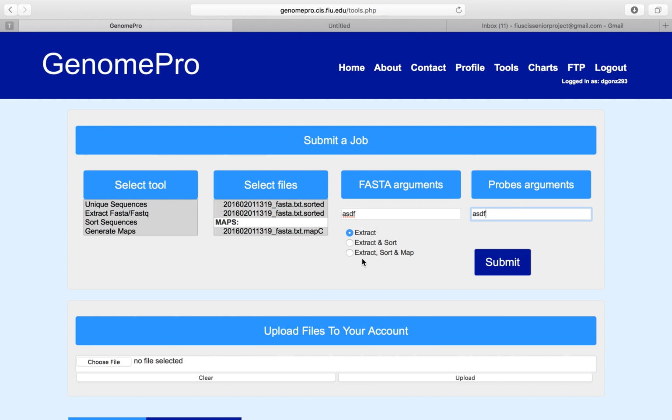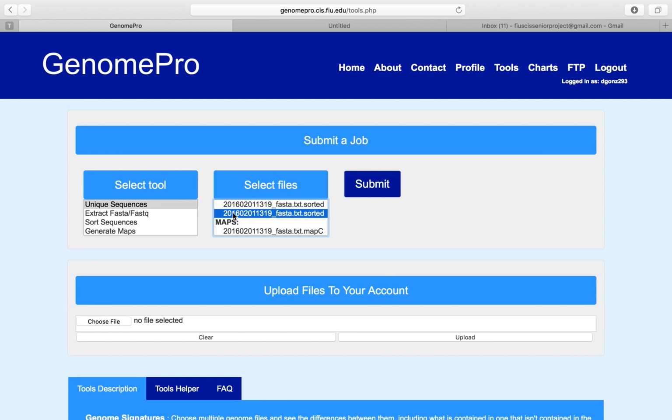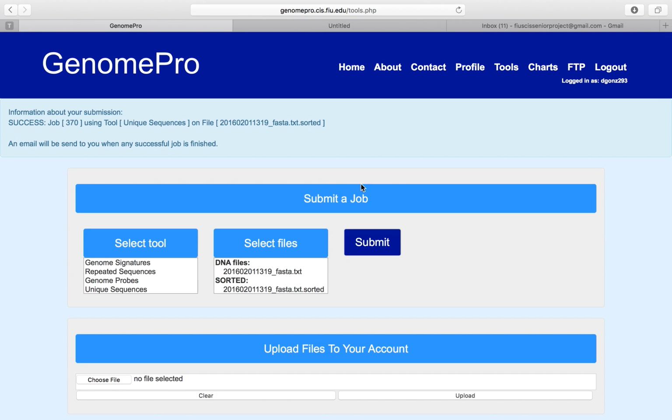So this right now that I've entered is obviously not a valid job. So I'll just submit a valid job for you, right here. Information about your job submission, it was a success, it's job number 370, and an email will be sent to you when the job is finished.